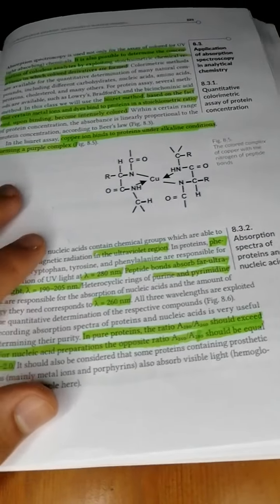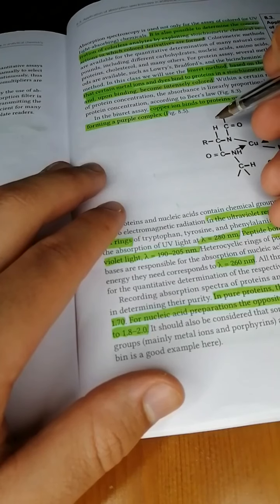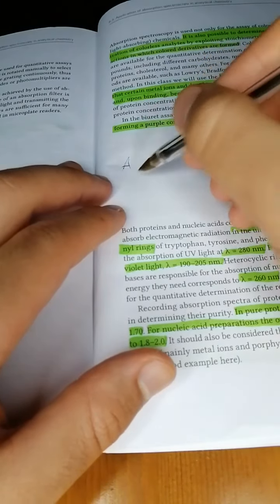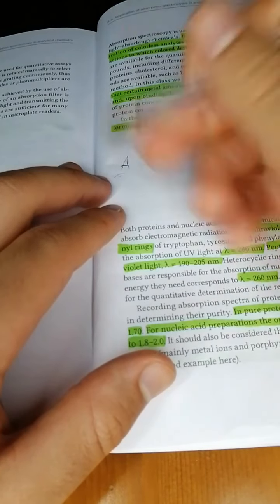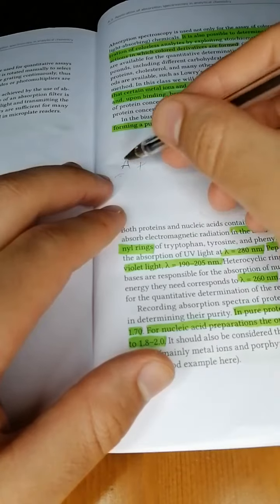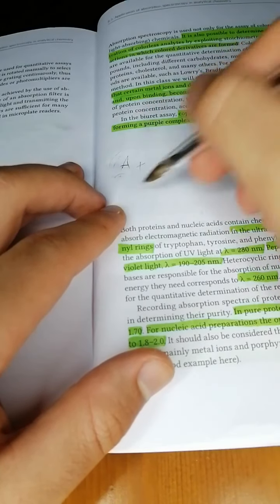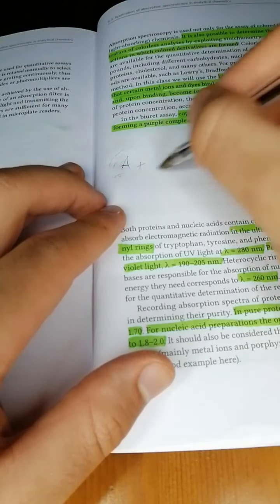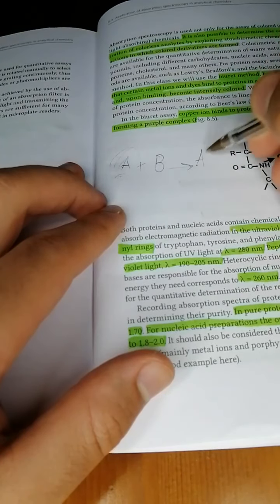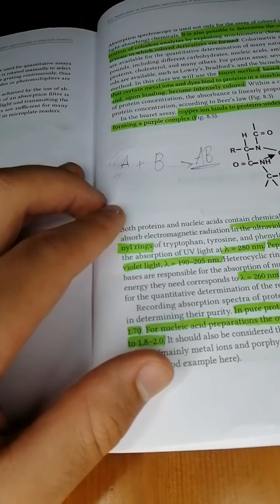So what does that mean? Let's say we have molecule A, and this molecule is colorless, and we have a solution of it, and we want to figure out the concentration. So what we might do is react the solution with another molecule, and that will give us a colored product.